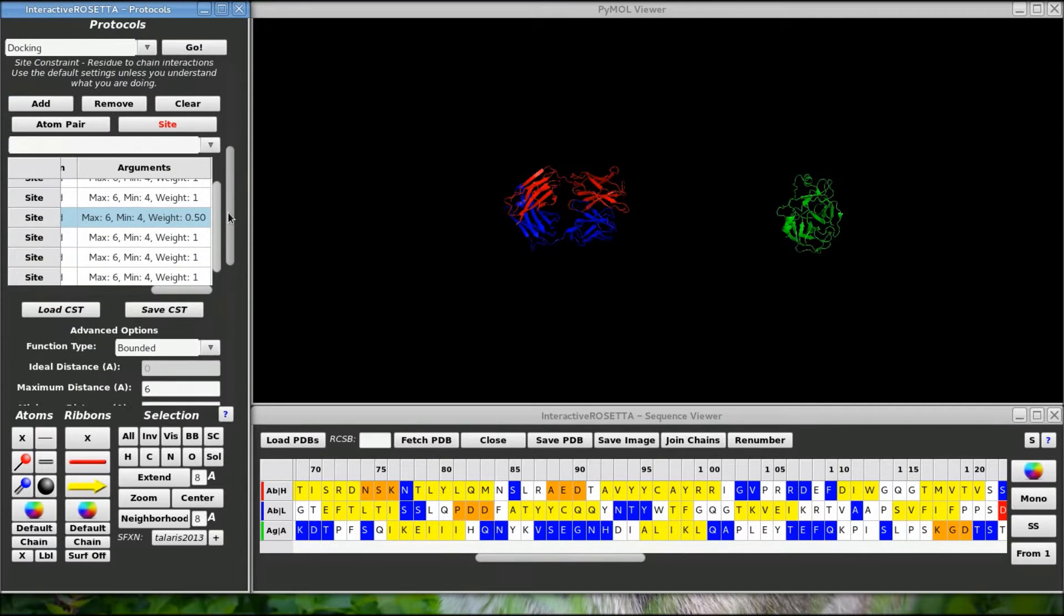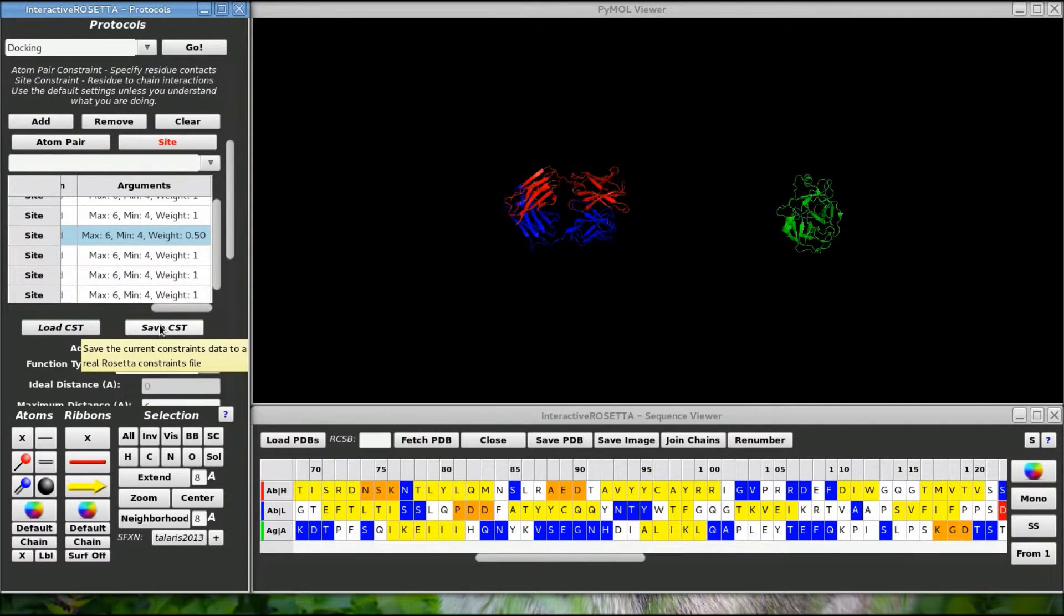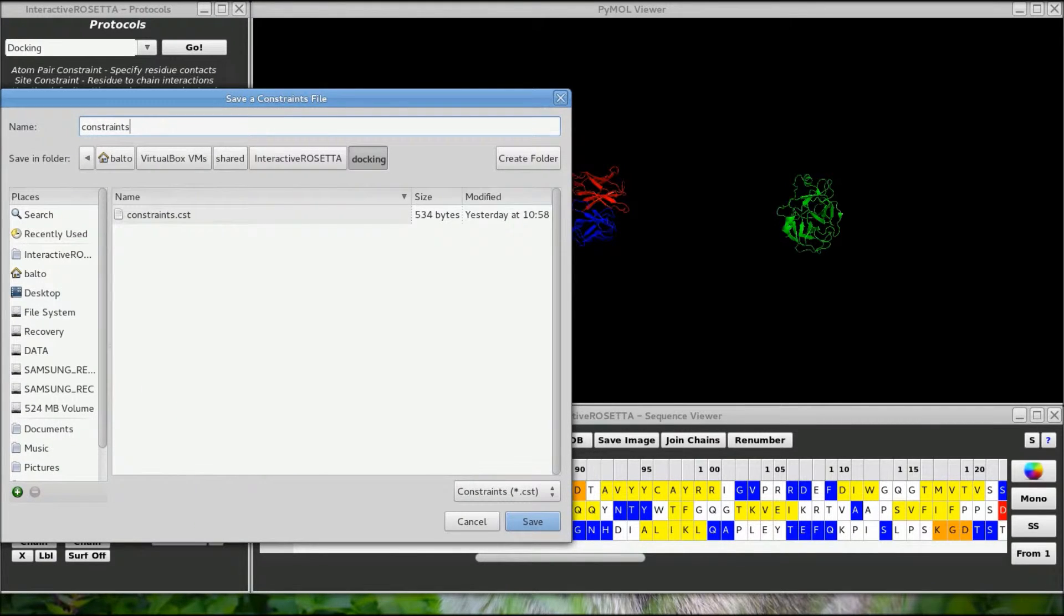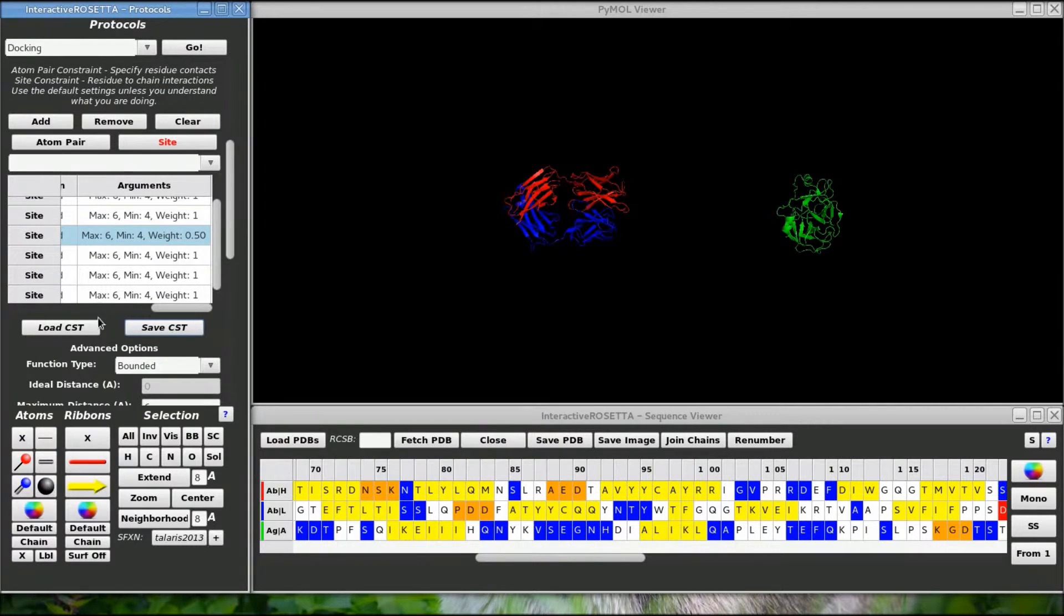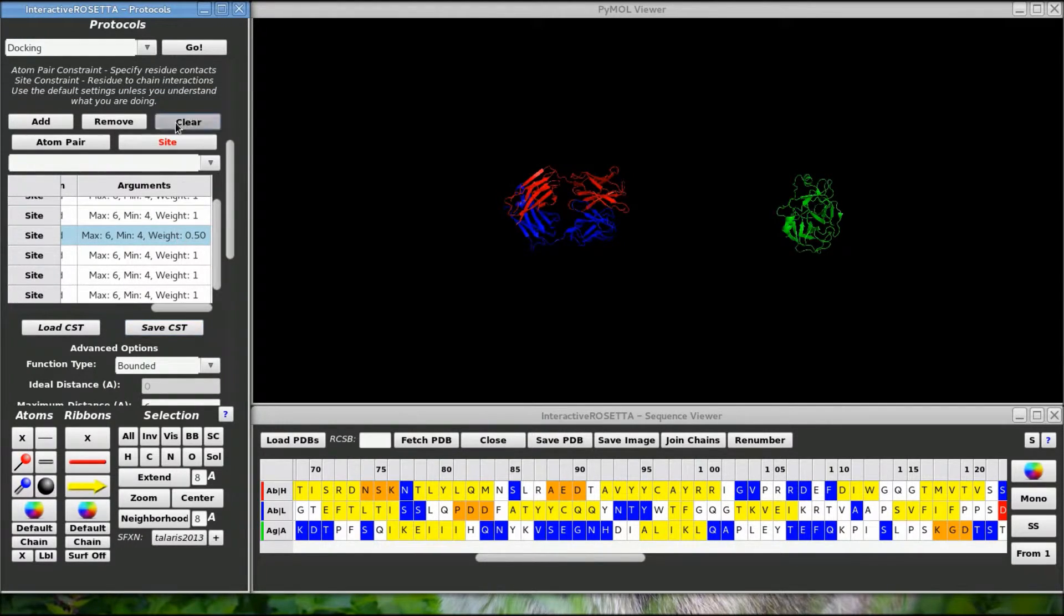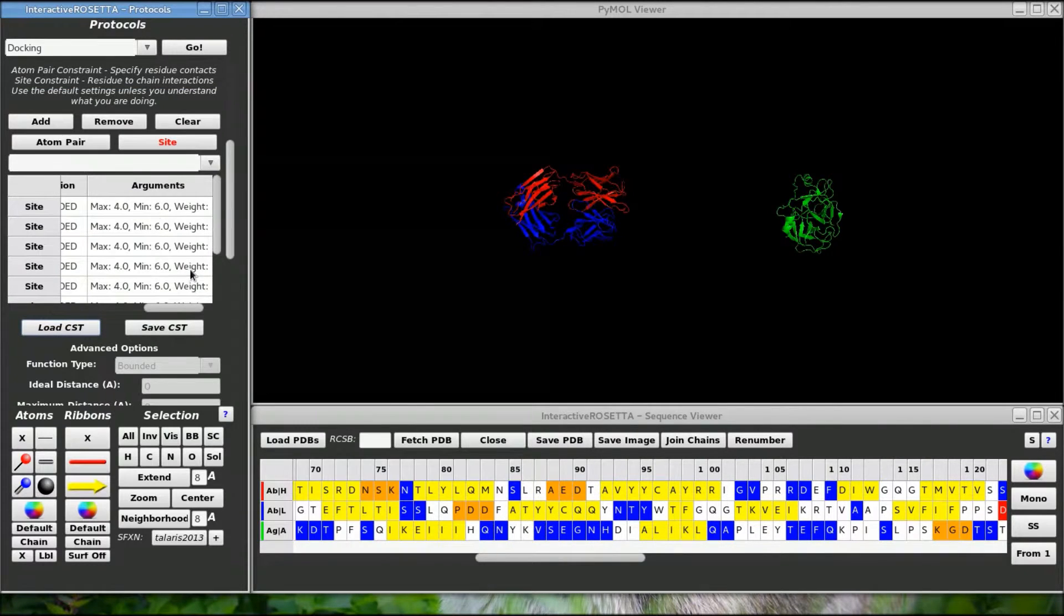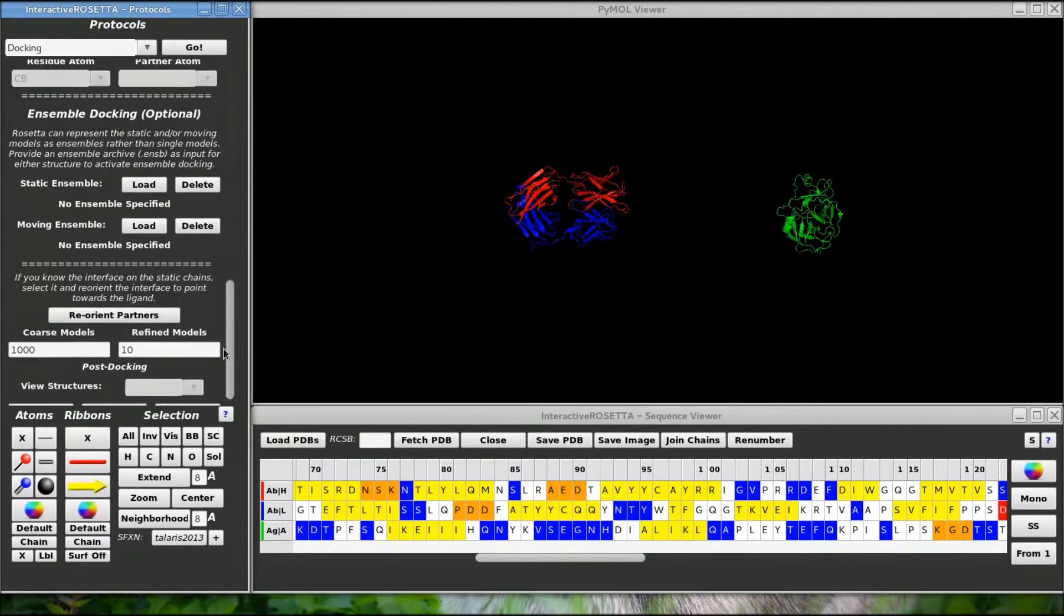Well that was tedious. So we should save a copy of this constraints file in case we need to come back to it later, then we can load it and skip all of what we just did, as long as the same models are loaded and specified up here. Let me load a constraints file with real constraints. What about this ensemble docking?